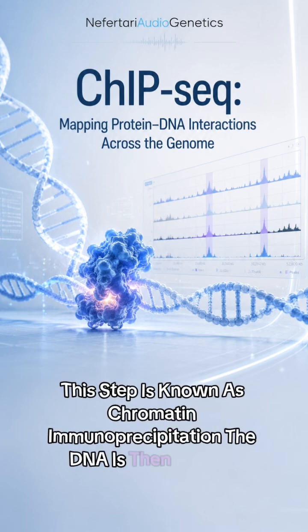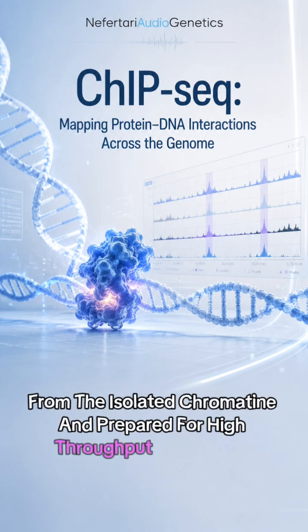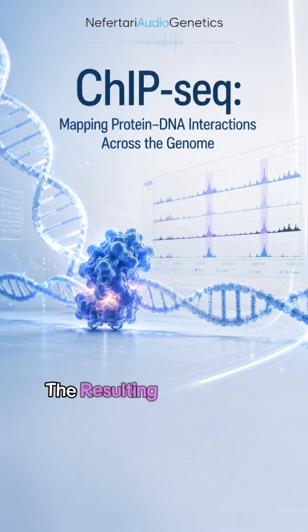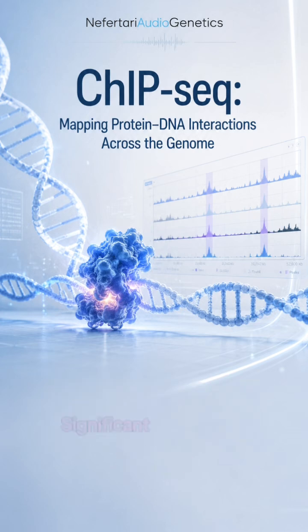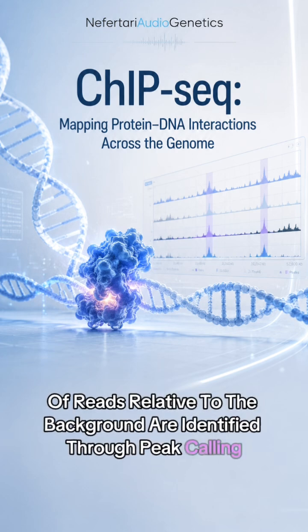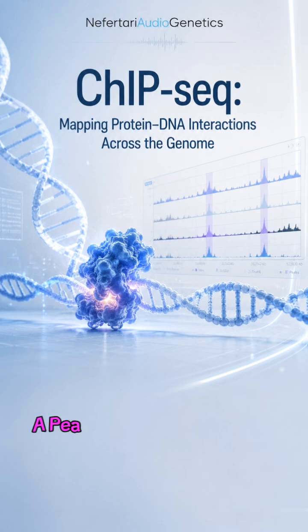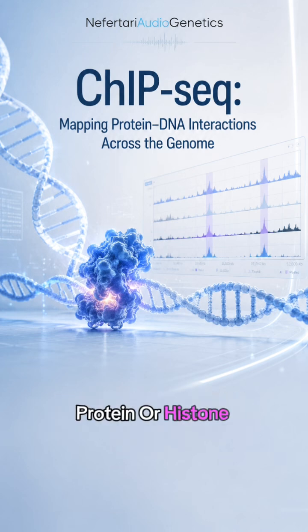The DNA is then purified from the isolated chromatin and prepared for high-throughput sequencing. The resulting sequencing reads are aligned to a reference genome, and regions showing significant enrichment of reads relative to the background are identified through peak calling. A ChIP-seq peak therefore represents a genomic region with enriched signal, indicating that the protein or histone modification of interest is associated with that region.